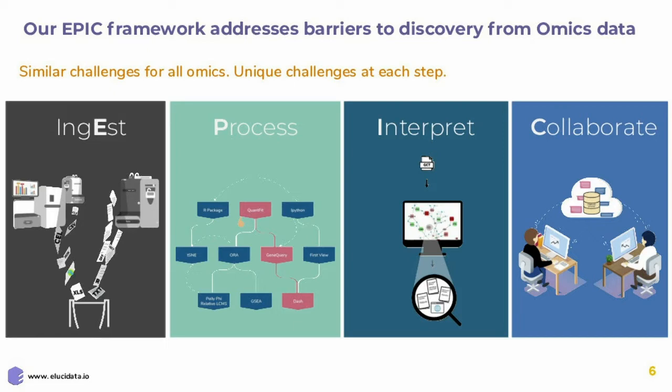Just as you ingest data from a computer that acquired data or a publicly available data set that you want to use, processing has its own set of challenges, with a lot of really compelling open source tools available, but they're not quite readily useful for scientists in the lab most of the time. And then, those open source tools have to be customized for your specific needs.